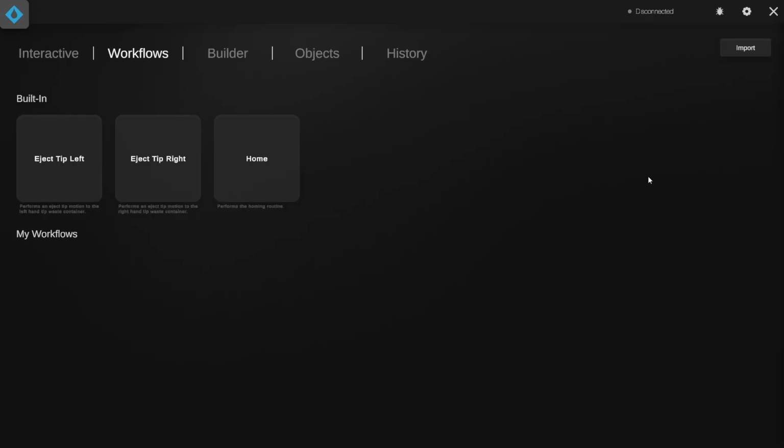Welcome to this short walkthrough of a couple of productivity hacks that you can use in Flow. When selecting items, whether that's in an edit or in a transfer, there are different ways you can do so. There are different selection modes, and when you're editing a transfer where the order of the selection matters, there's also a drag select mode that can be changed within the settings.